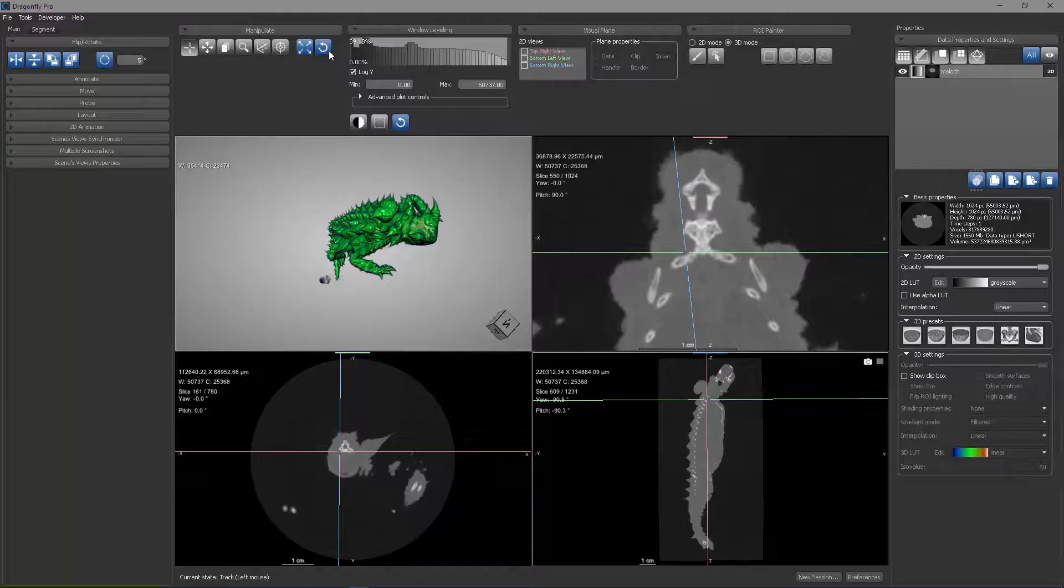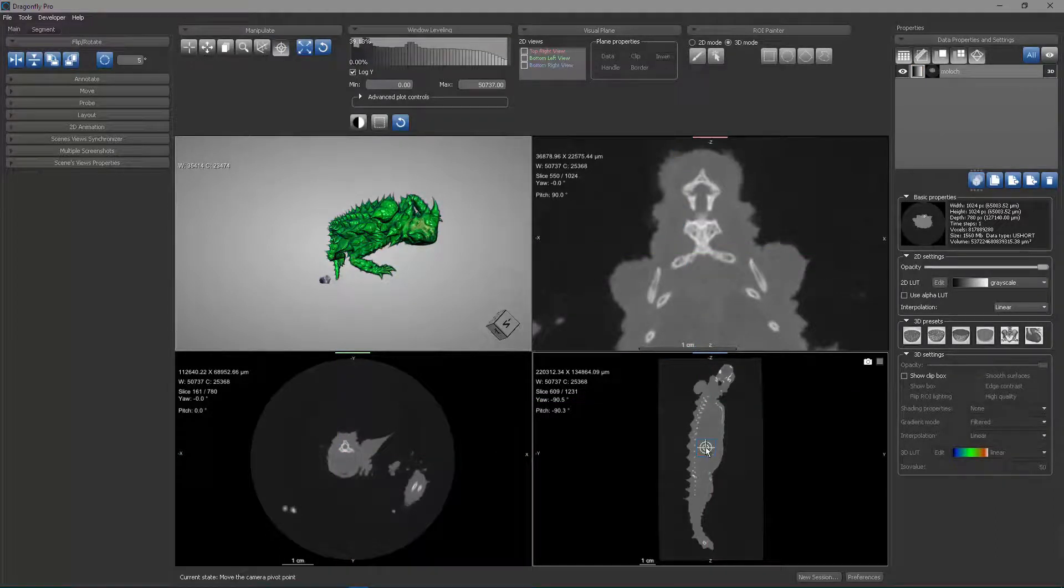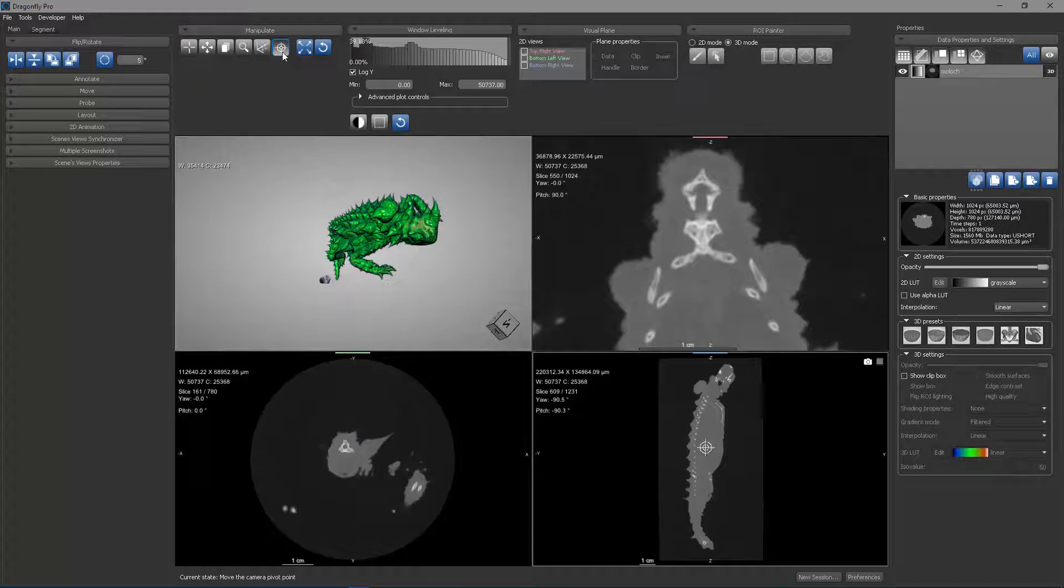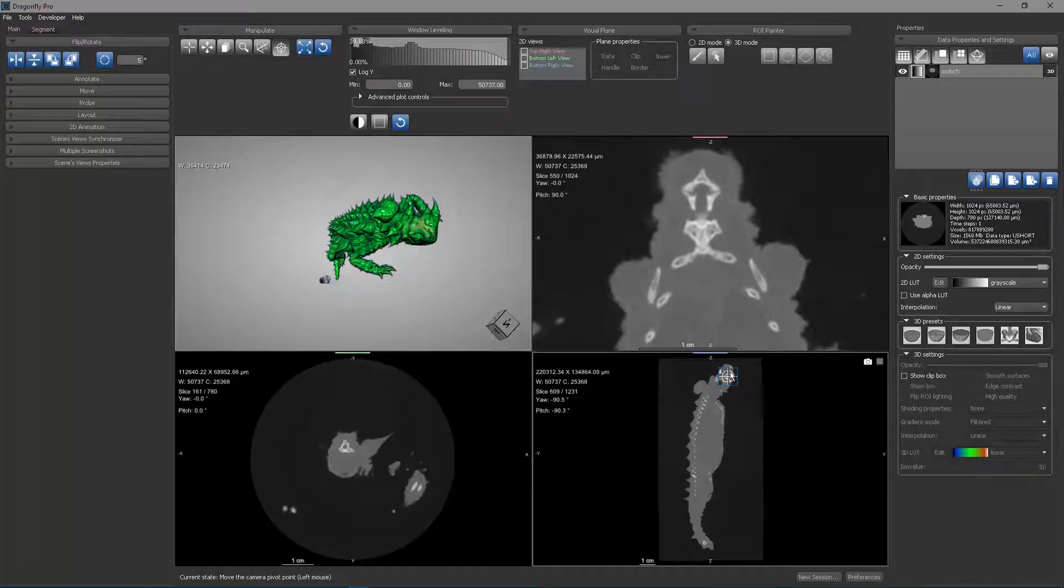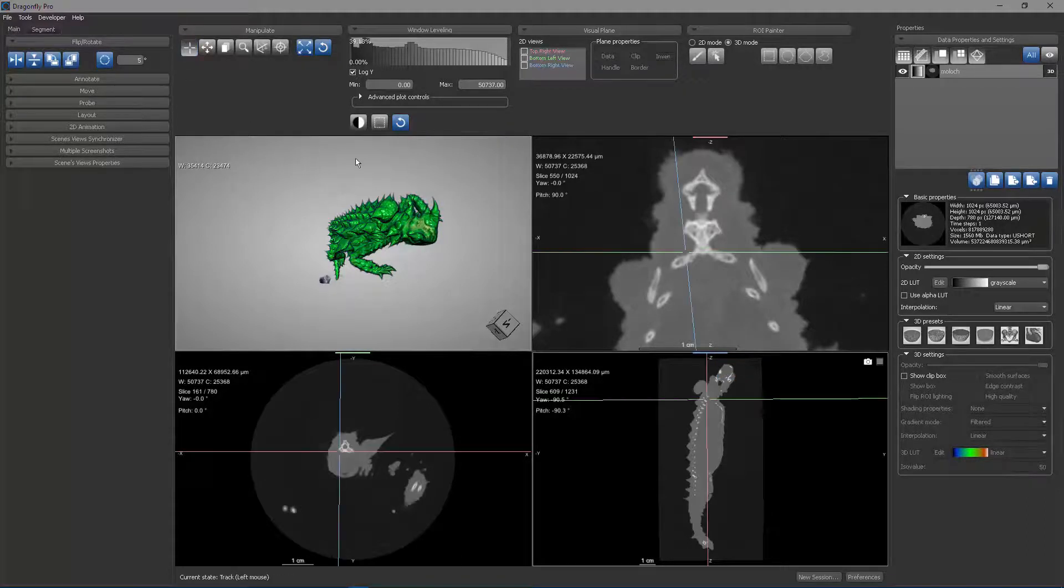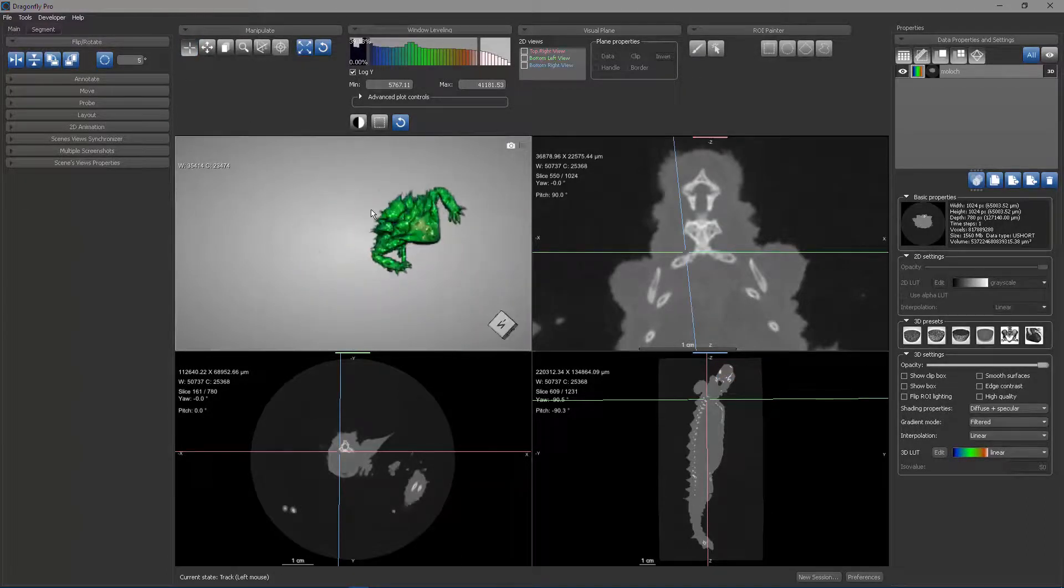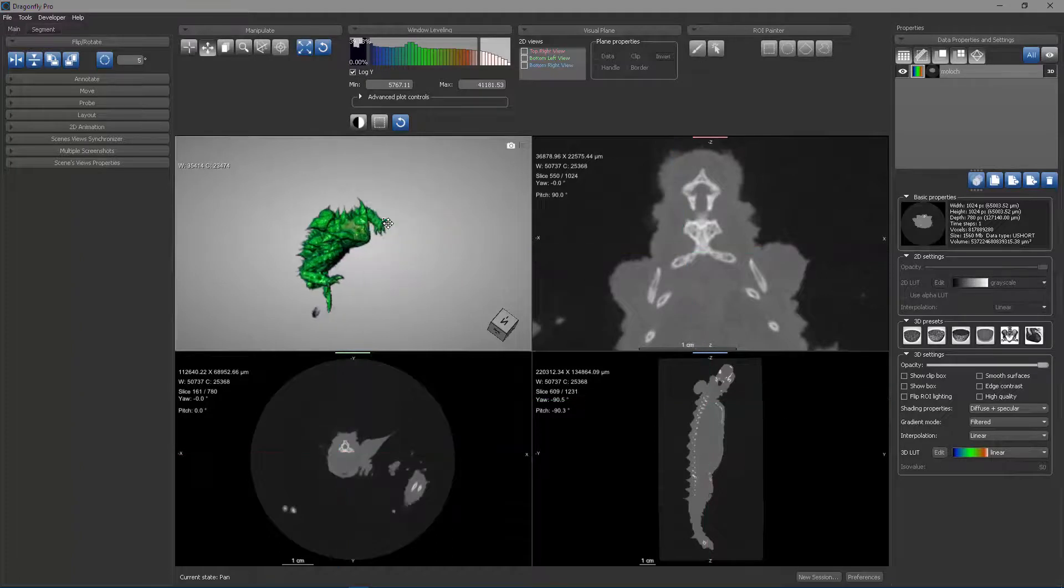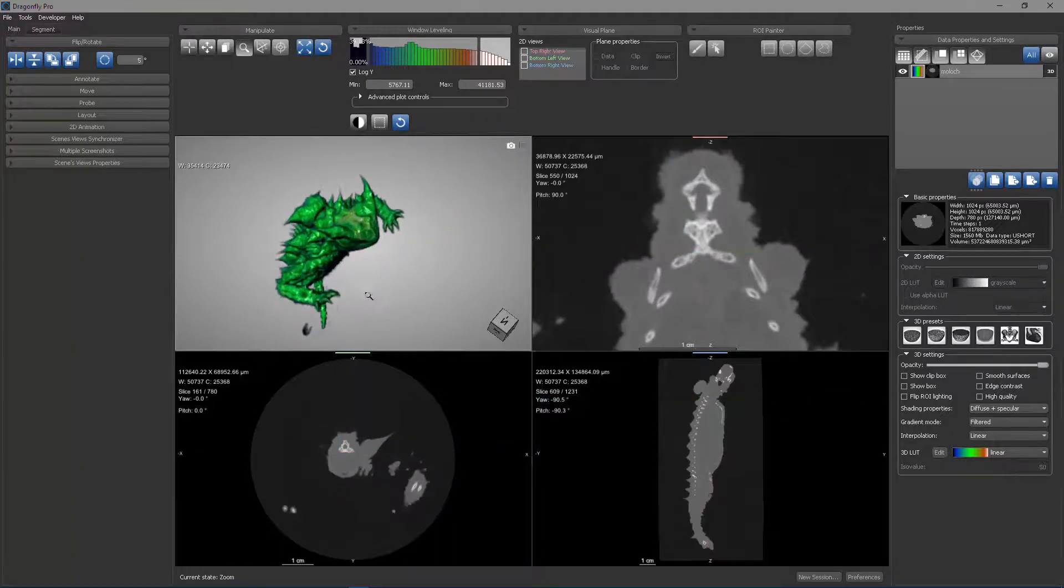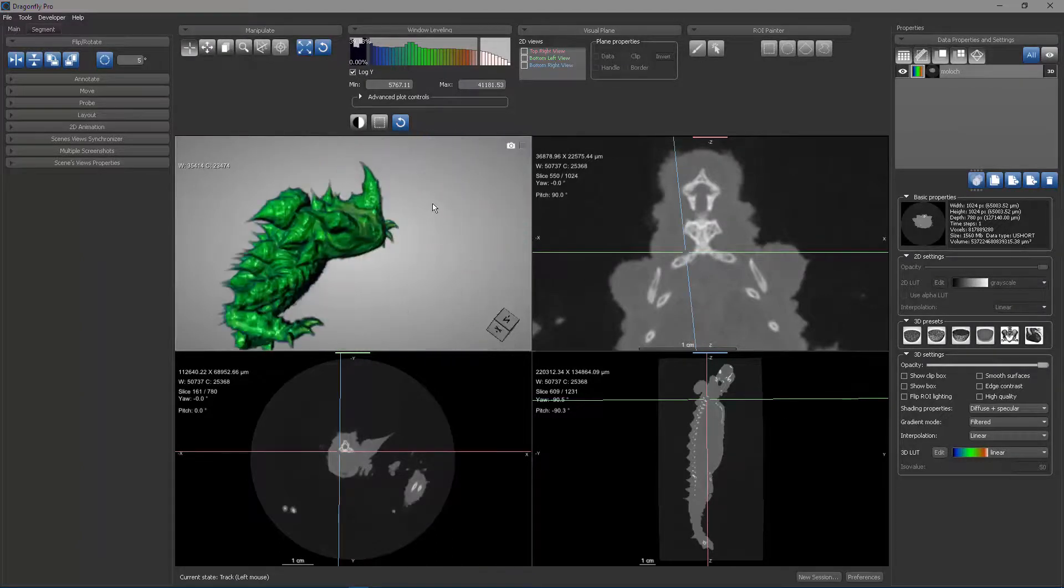However, if I use this pivot point state to translate this to the tip of the head, now when I'm in track state, you can see I'm rotating around that position. I can still pan and I can still zoom, but I'm rotating around that.